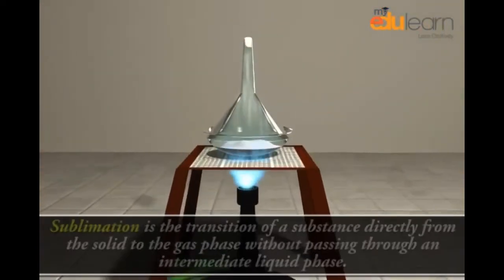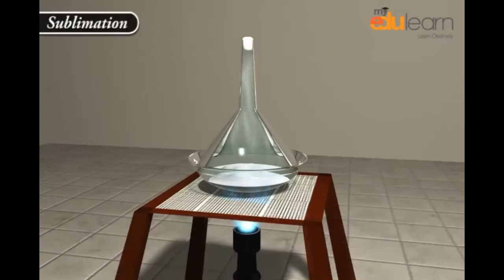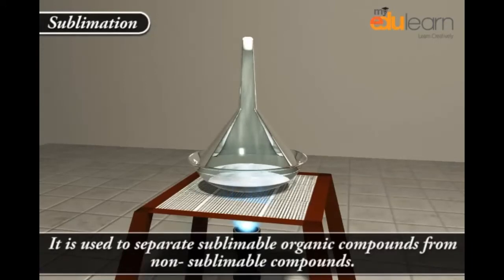Dear students, sublimation is the transition of a substance directly from the solid to the gas phase without passing through an intermediate liquid phase. Sublimation. Some solids change directly from the solid state to vapor state on heating. This process is termed as sublimation. It is used to separate sublimable organic compounds from non-sublimable compounds.